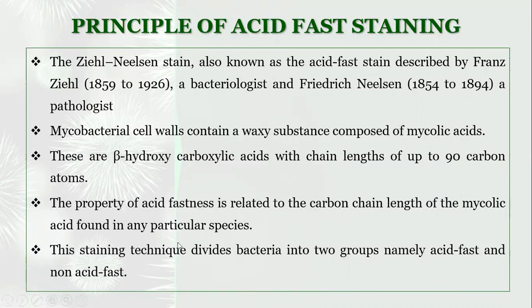This staining technique divides the bacteria into two groups: acid fast bacilli and non-acid fast bacilli. Acid fast bacilli are Mycobacterium species, non-acid fast bacilli are non-mycobacterium species.